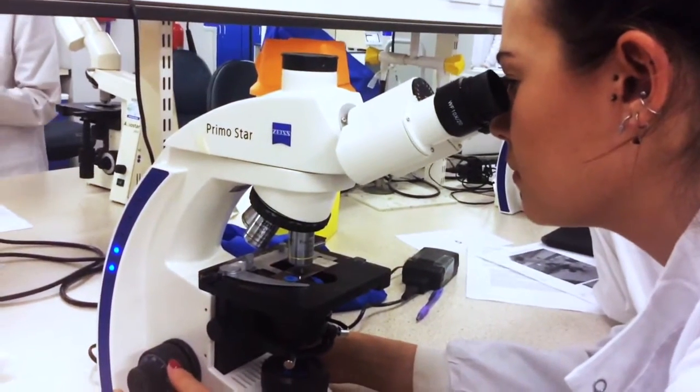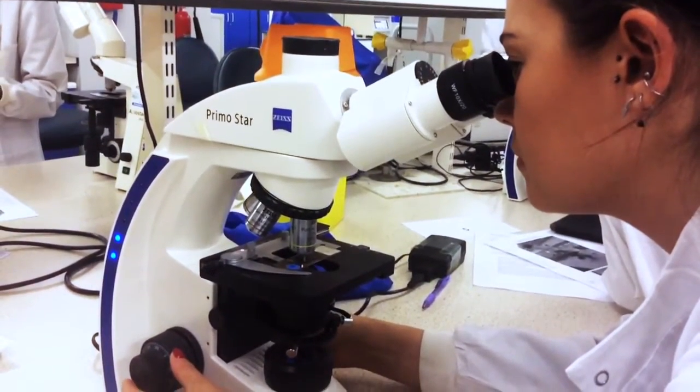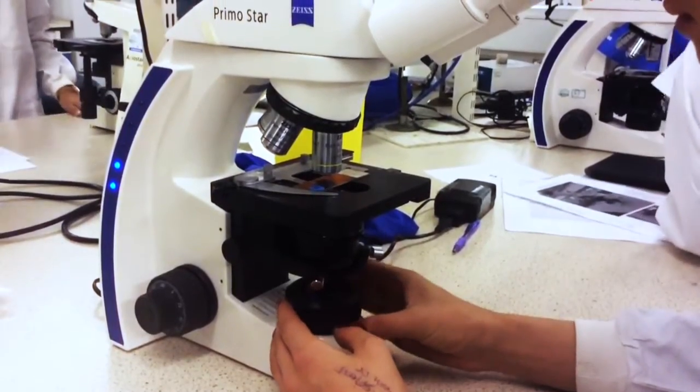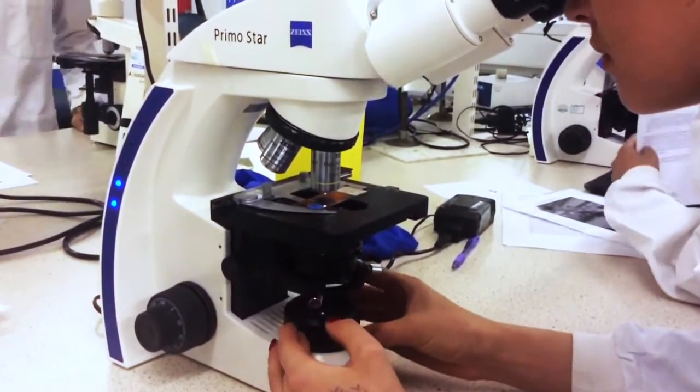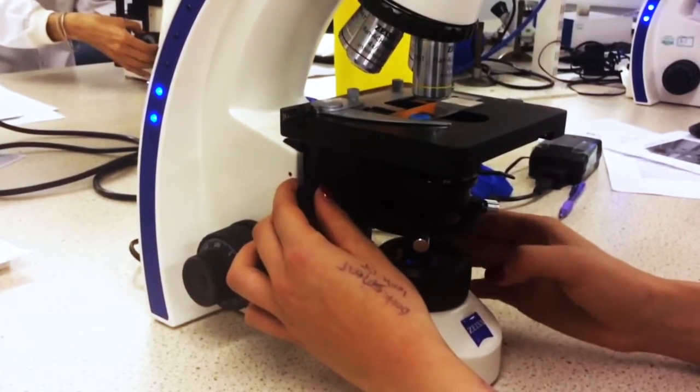Look down the eyepiece and move the stage down using both coarse and fine focus control. Close the field diaphragm using the wheel control. Form an image of the field diaphragm.